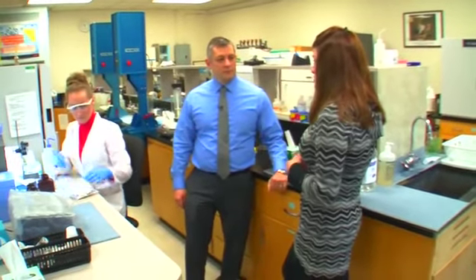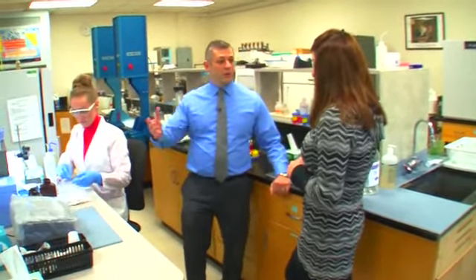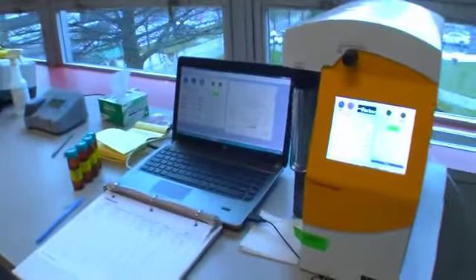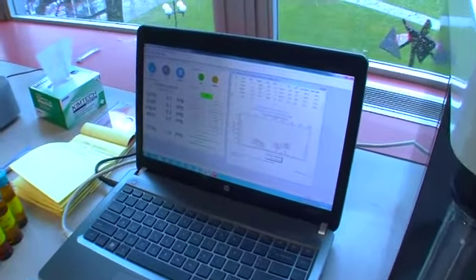So to the non-scientist, basically all that means is just making sure there's nothing bad in the drinking water. Exactly, and that's what we want the public to be aware of, what we're doing here. Another test that's performed at the laboratory is trihalomethane testing. When we were up at the treatment plant over the summer, we had talked about disinfection byproducts as an effect of chlorinating the system mixing with organics. We have the ability here to track our THMs, or trihalomethanes, throughout the distribution system to make sure that they remain below the regulatory limit.